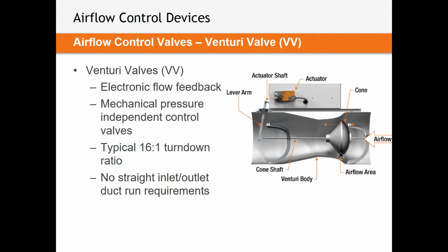I'm going to show an example of that in a little bit, but specifically the fume hood environment, specifically a manifolded fume hood, uses that part of the technology extremely well.